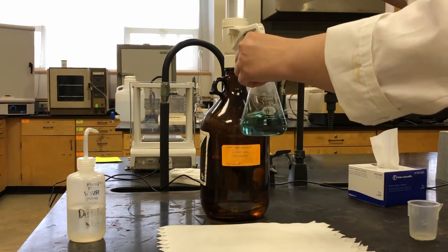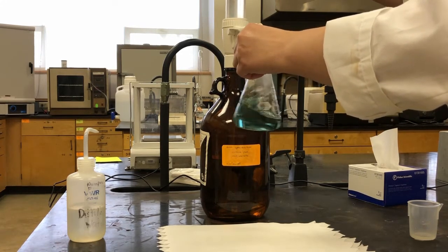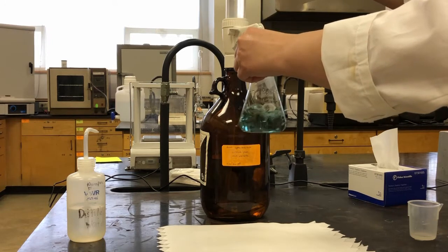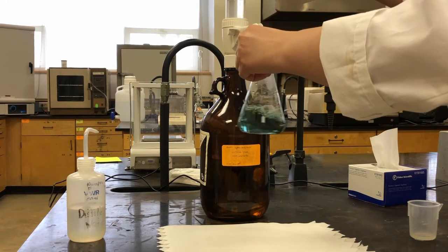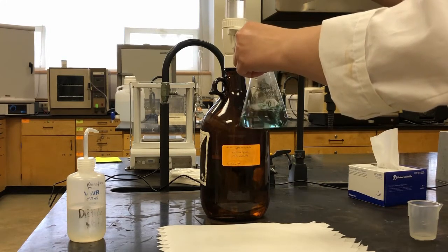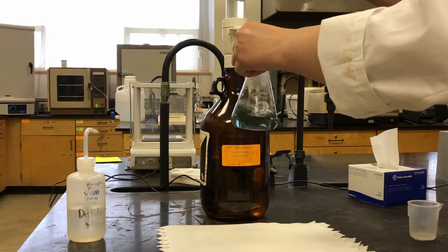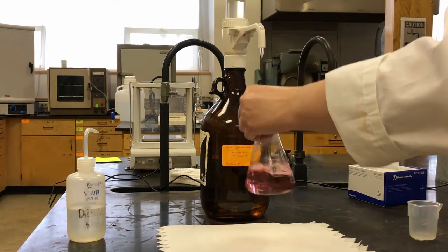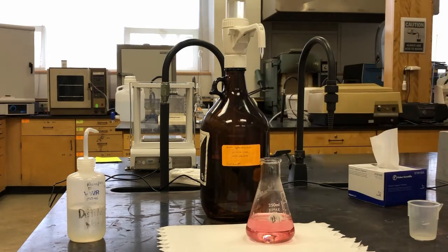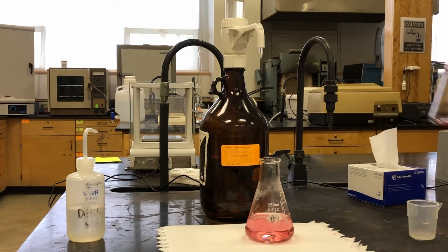I'm just adding hydrochloric acid very slowly at first, and we're looking for a color change from the green color to the original red color of the boric acid with the indicator. Okay, there we go. So you can see we're right back to that original color that we started with of the boric acid. So we've reached the end point of our titration.